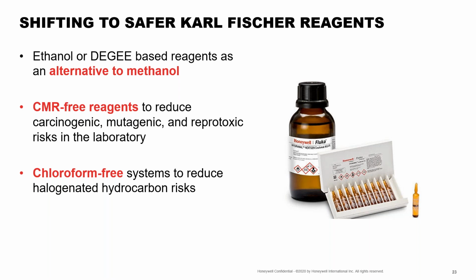Methanol is fairly toxic, so you have options to shift to ethanol-based reagents if that's something of interest to your lab. Another category here is CMR substances, particularly impactful within the European Union as it's a European Commission restraint. We always want to be avoiding any CMR classified substances in our work in the lab. Anytime that we can avoid a cancer risk, mutagenic risk, or of course reprotoxic risk, we want to be doing so.